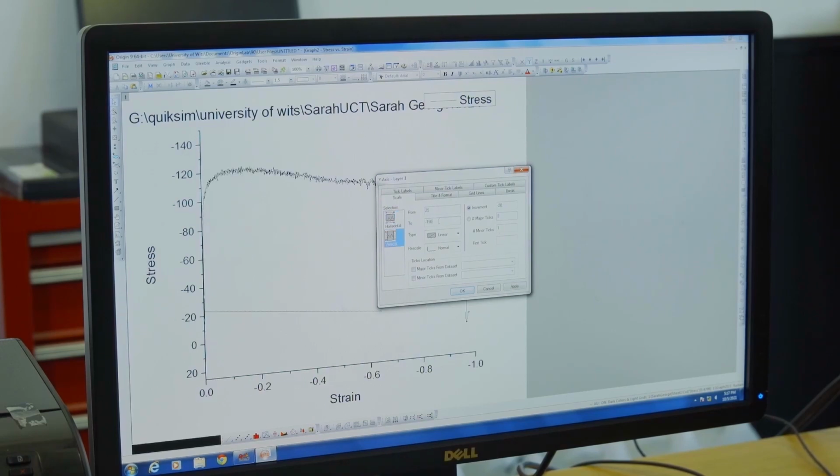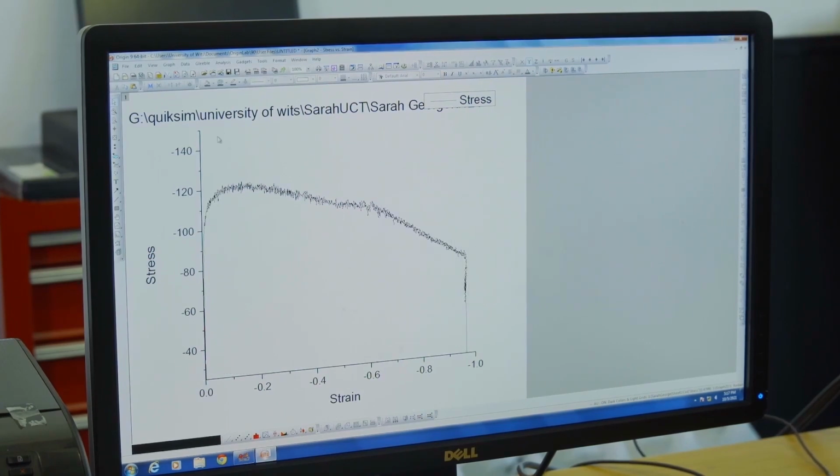And on the vertical side, I'm going to go in compression by 20, and I'm going to click apply, and I think I need to go a bit more, 25, apply, and that's it. So you see it's much neater.